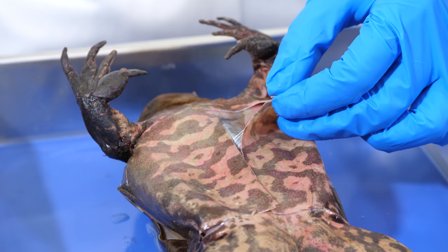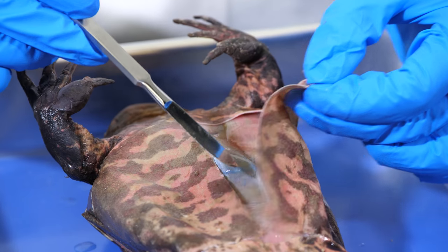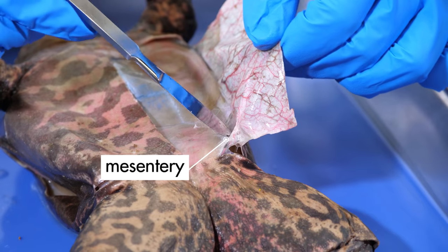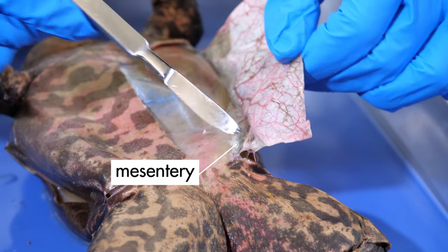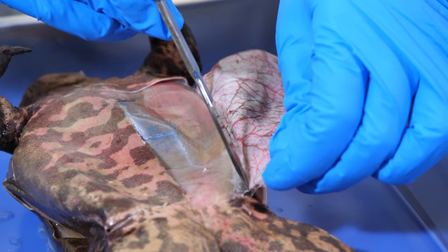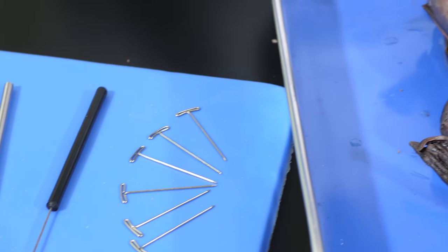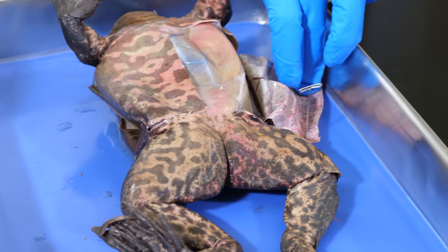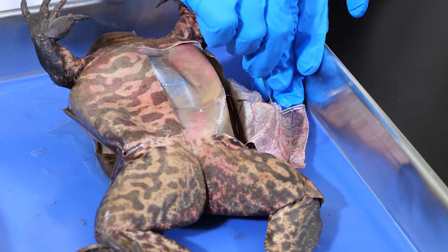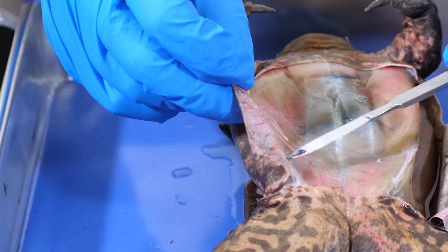After making our incisions, we need to pull up the skin to loosen some of the tissue that connects the skin to the muscles. This connective tissue is called mesentery. Some of the mesentery easily comes loose, but some needs to be cut loose with a scalpel. Then, we need to use T-pins to secure the skin to the dissecting pad. Then we repeat the procedure on the other side.